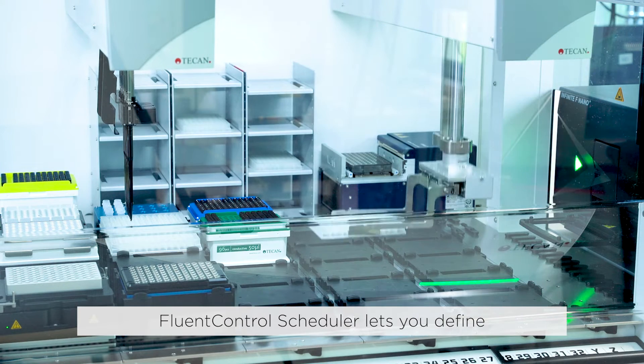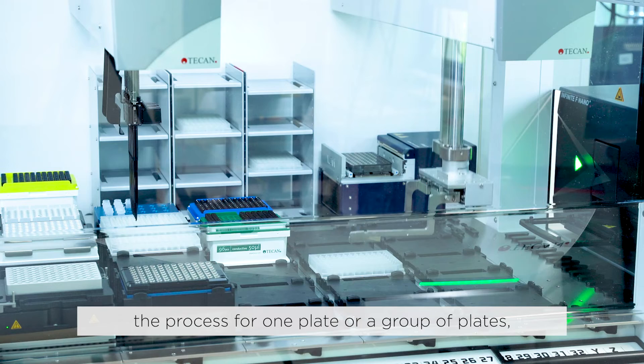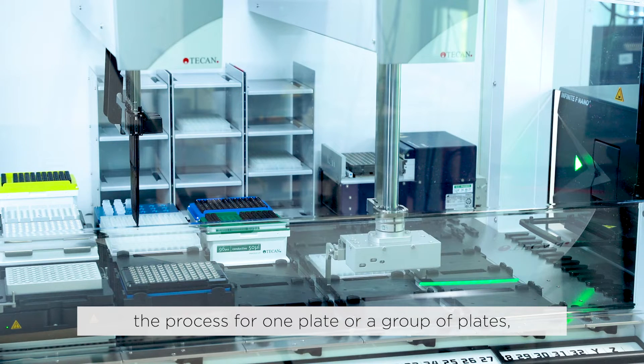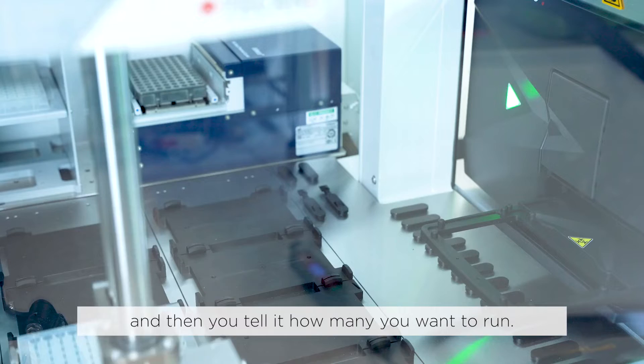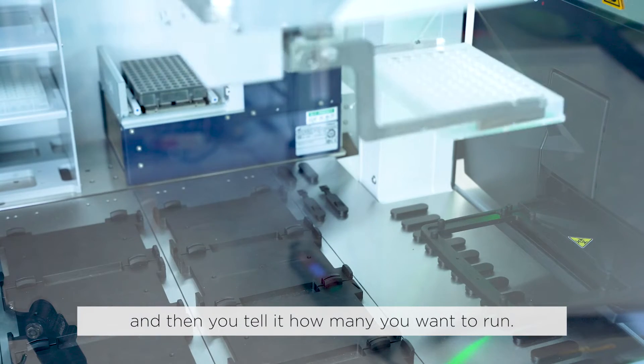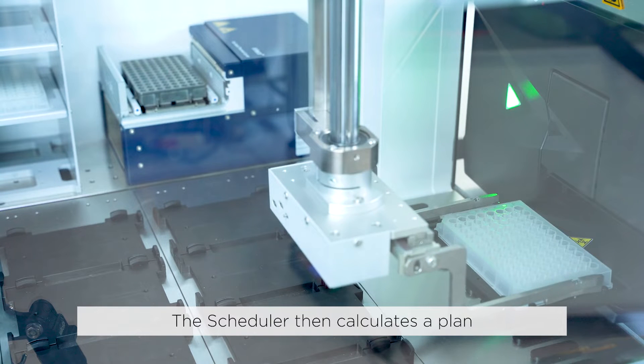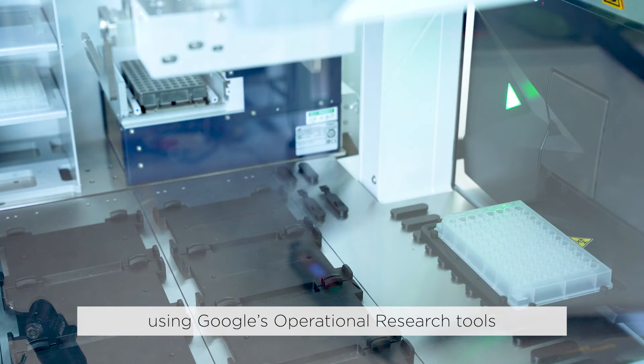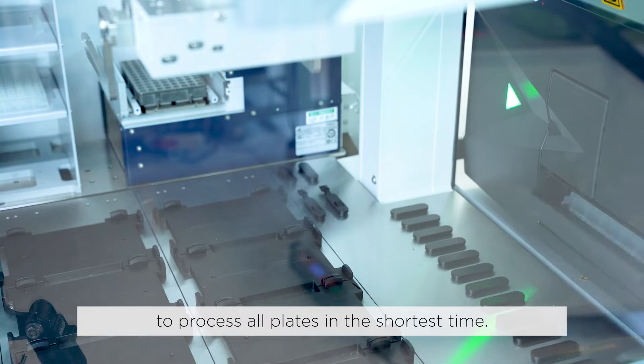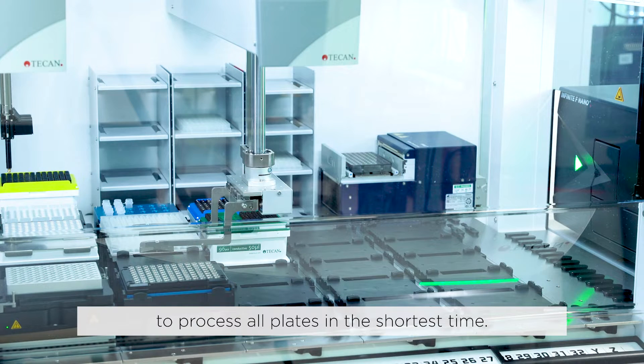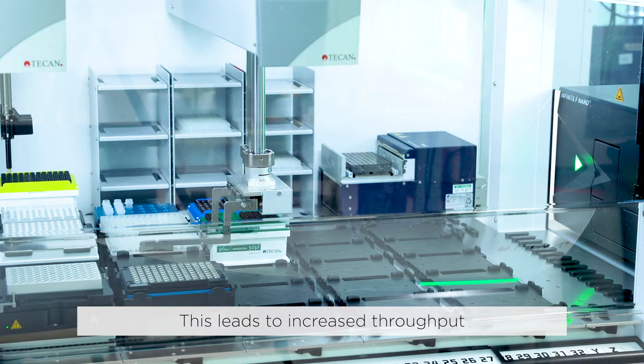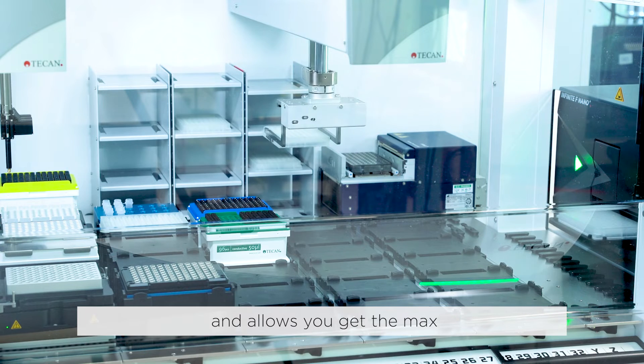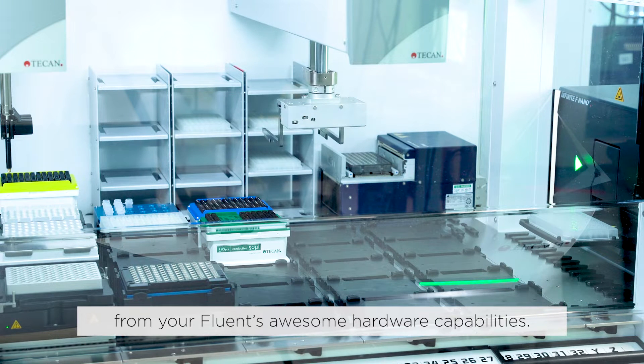Fluent Control Scheduler lets you define the process for one plate or a group of plates, and then you tell it how many you want to run. The scheduler then calculates a plan using Google's operational research tools to process all plates in the shortest time. This leads to increased throughput and allows you to get the max from your Fluent's awesome hardware capabilities.